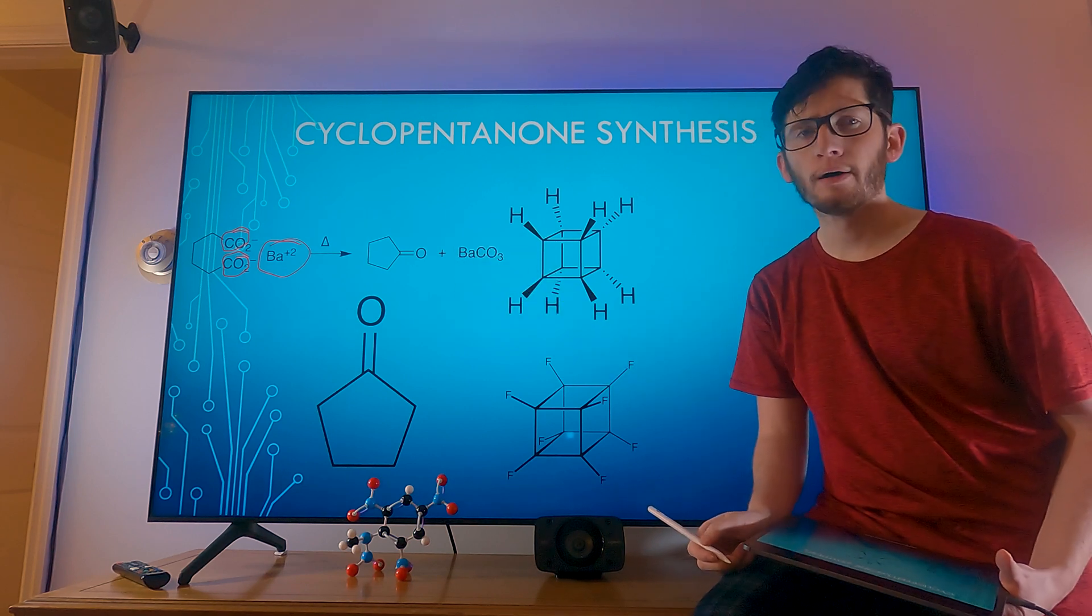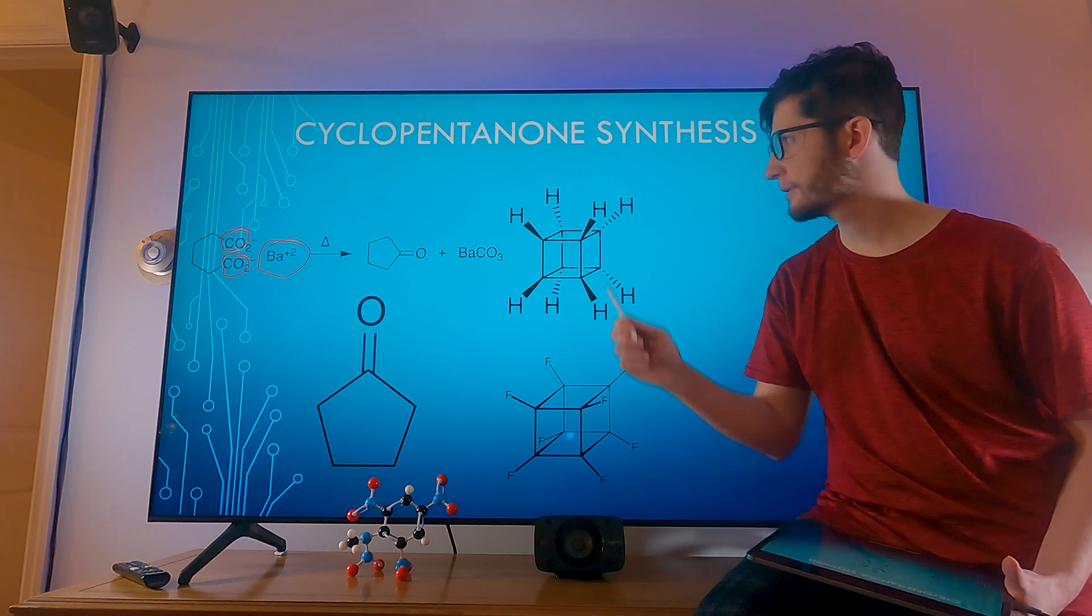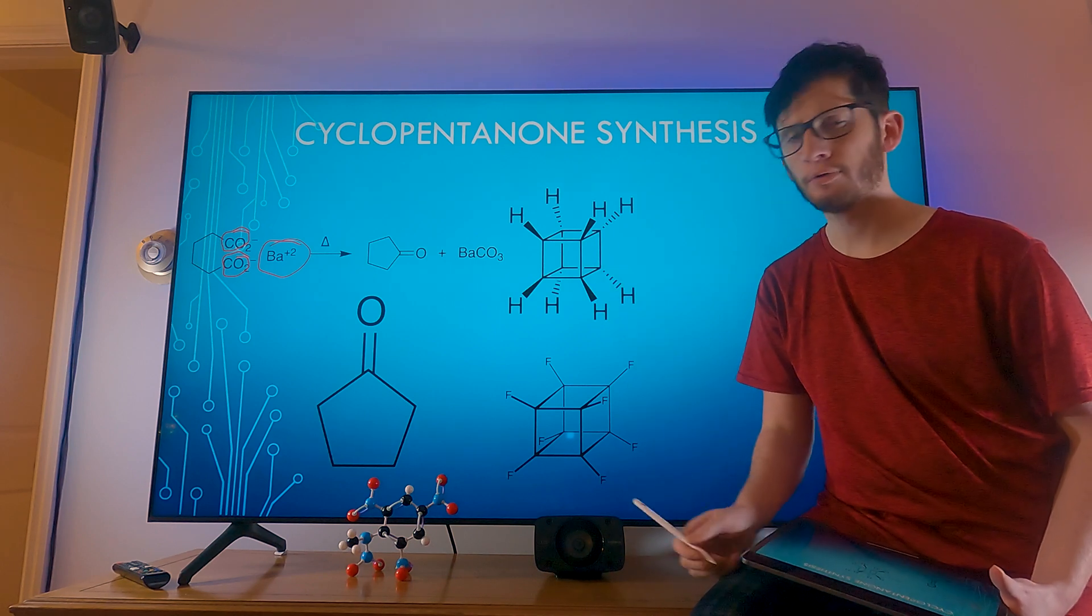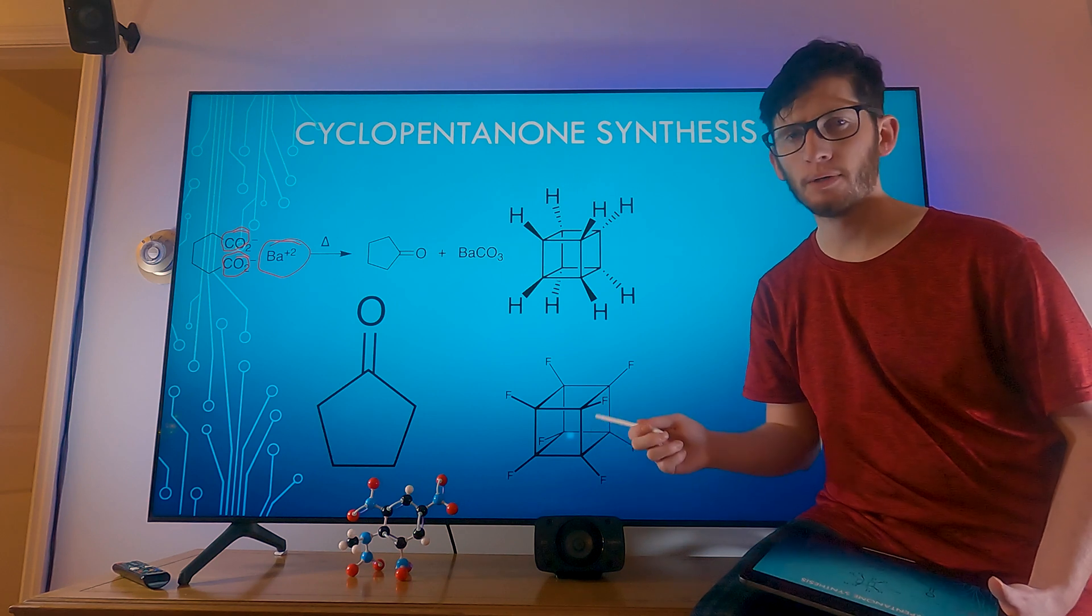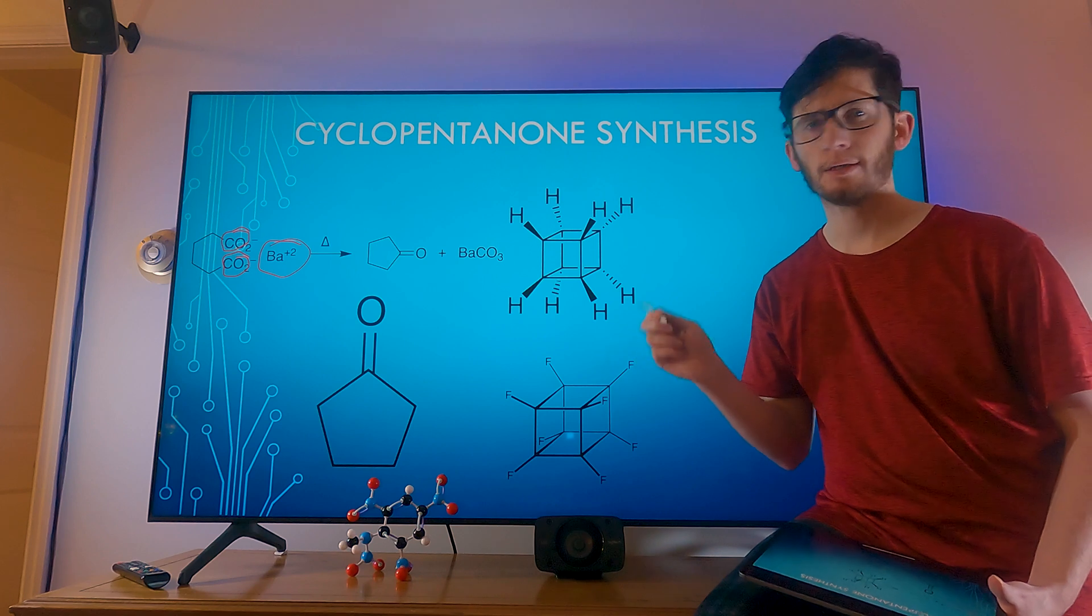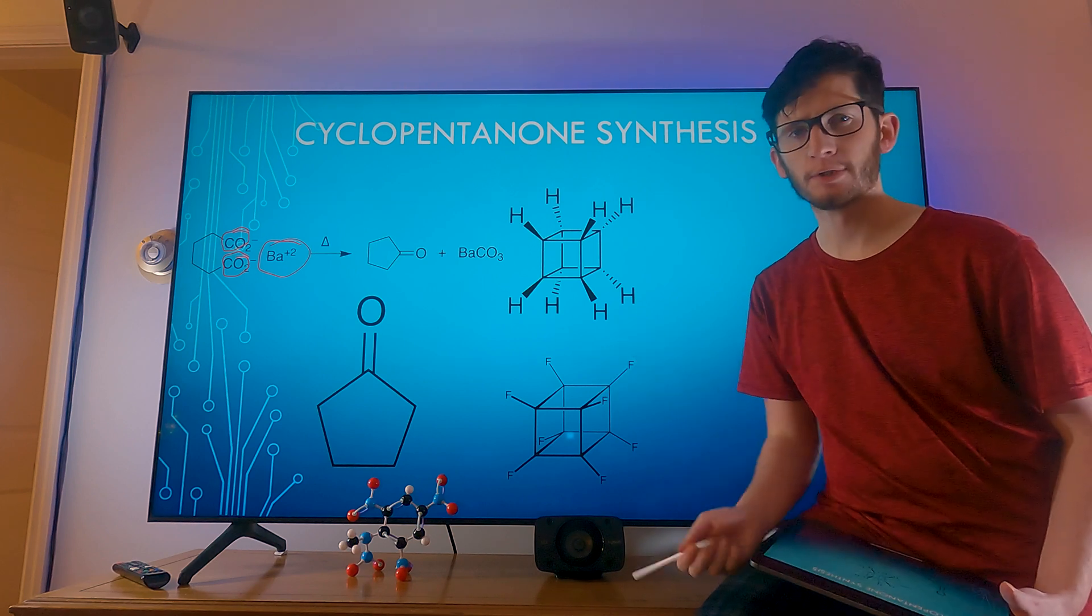So we are making this in our quest to make cubane and hopefully a fluorocubane and a few other exotic cubanes. Maybe take a crack at some energetics or something special there.